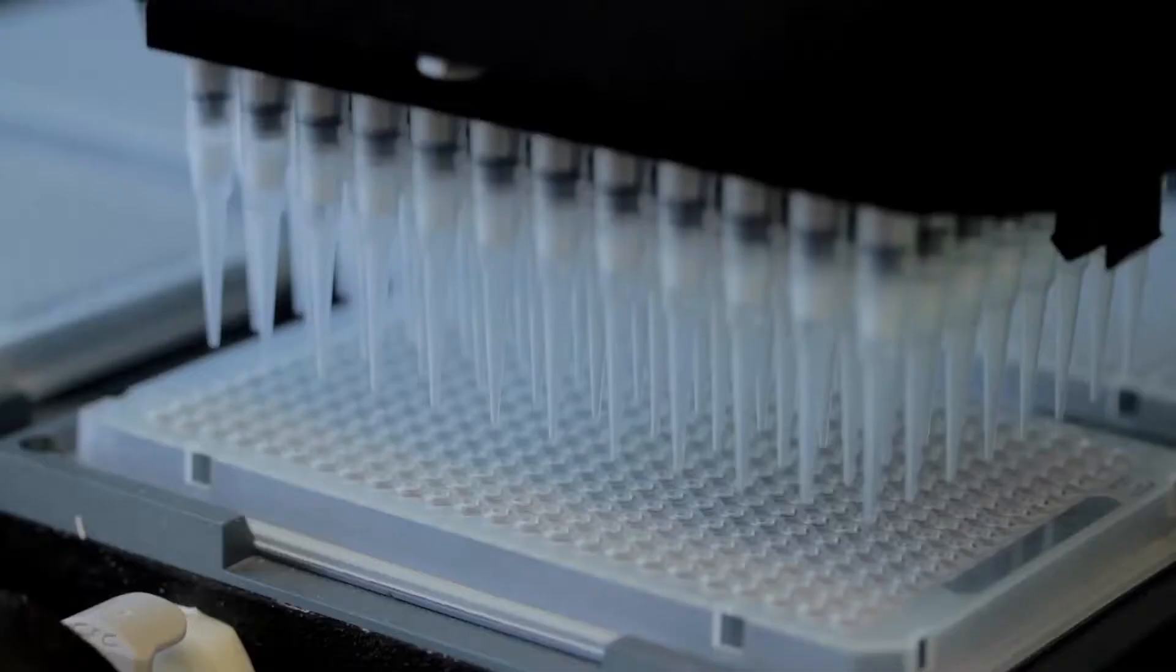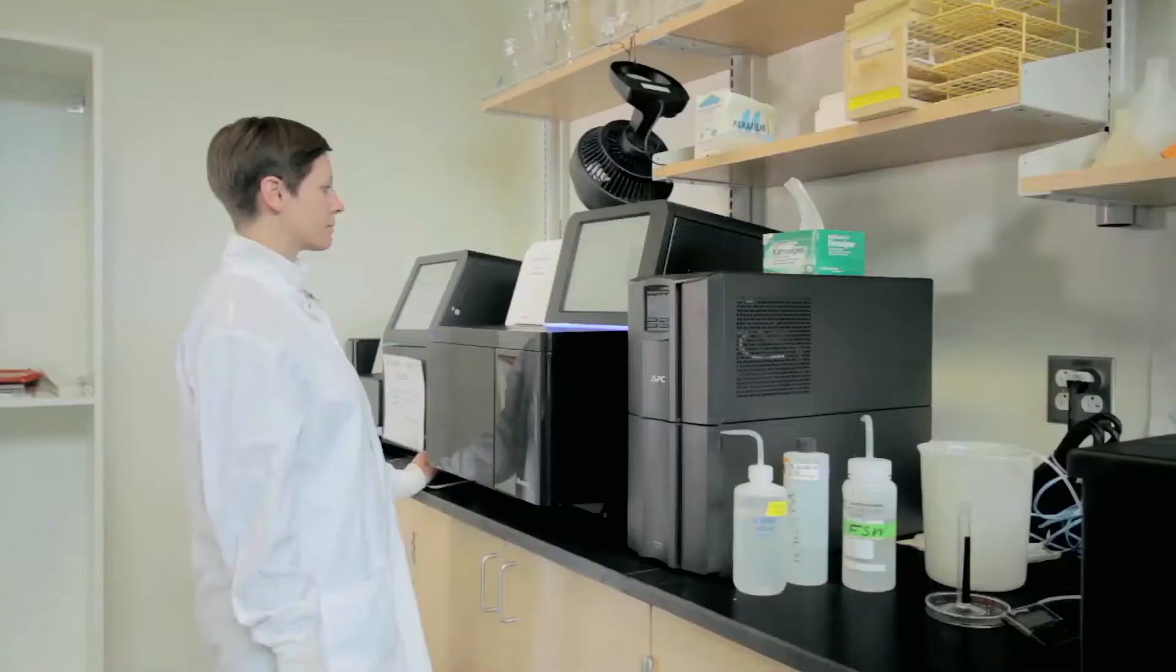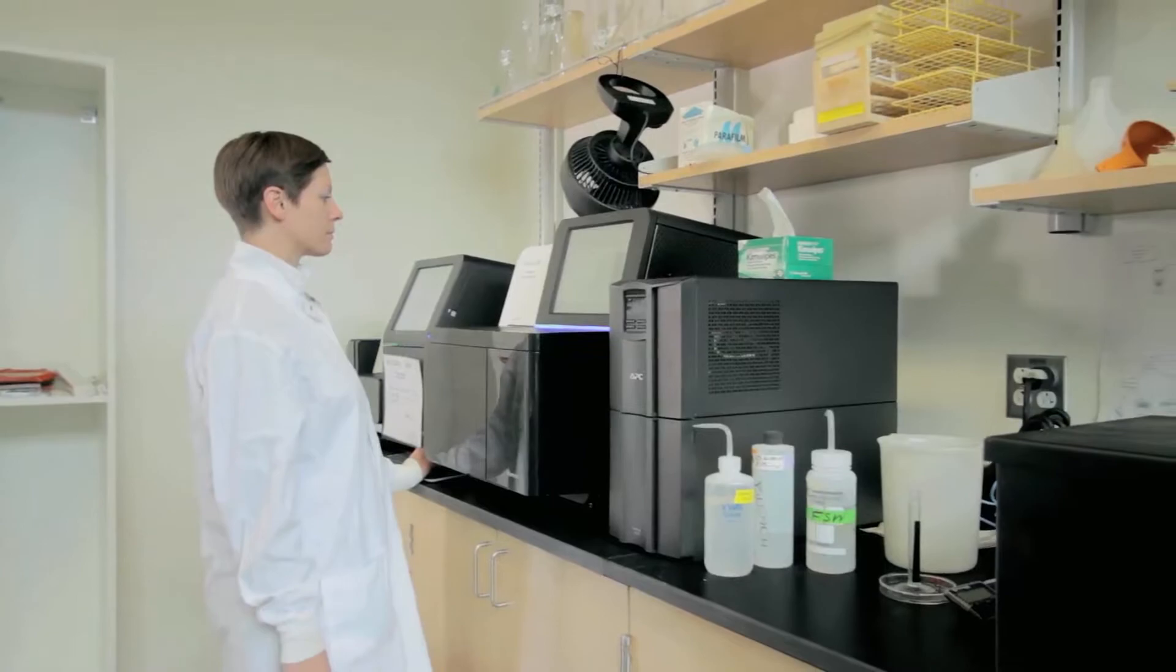Liquid handling robots are also employed to prepare DNA libraries for genomic sequencing. Library preparation involves shearing of genomic DNA into short fragments and adding molecular adapters and barcodes.